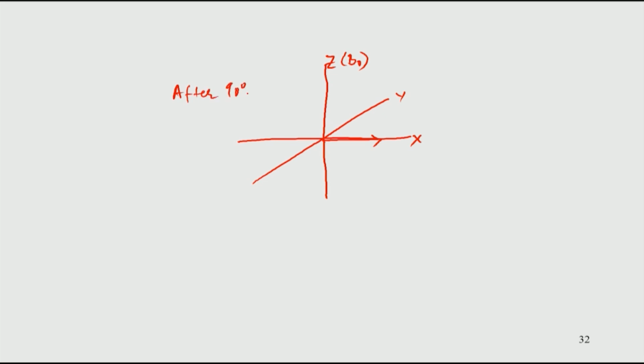So, let me explain this more in a pictorial form. Let us look at how we started. This is the net magnetization which is now along the x axis, and this is our z axis. This is where we apply the original B0 magnetic field, and this is the y axis. This is a scenario after application of a pulse. After a 90-degree pulse, the magnetization is lying along the xy plane in the x axis. Now, what happens is during this T2 relaxation, the molecules, the spins now start dephasing.